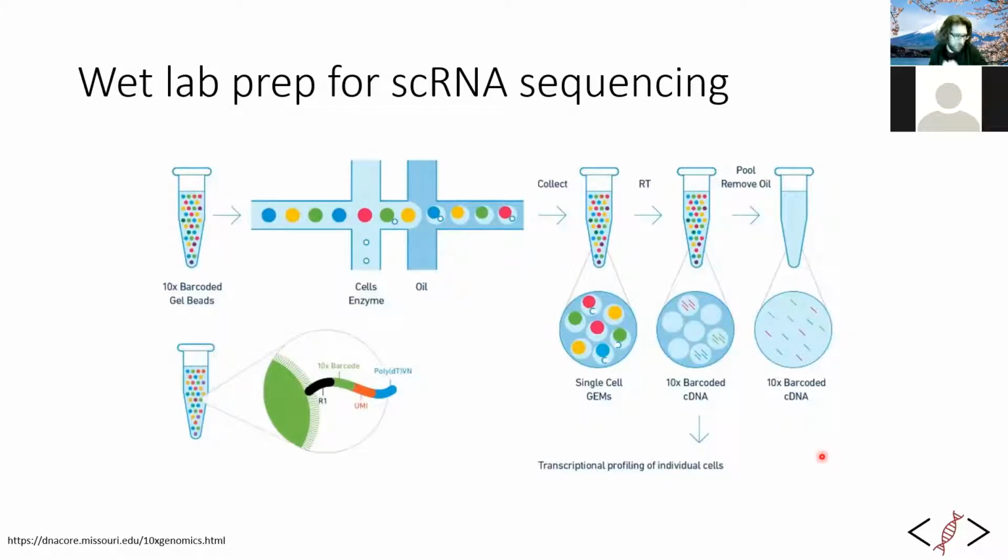And we'll talk about the quality controls that you use to deal with the cases where you have more than one cell or less than one cell or some other source of error. This can all be taken now and sequenced directly. The other thing that you have is a unique molecular identifier, and we'll talk about that in a minute, why that's important.